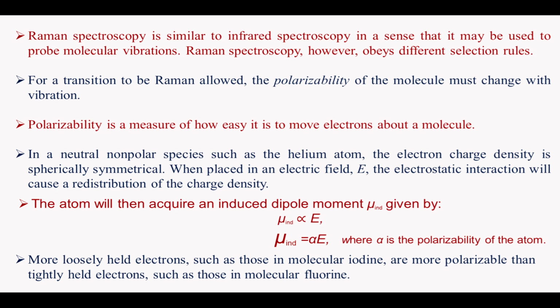Even in the case of a homonuclear diatomic molecule like H2, N2, O2, which doesn't give you the IR spectrum, they will give you the Raman spectrum.